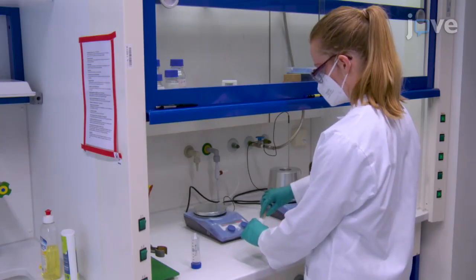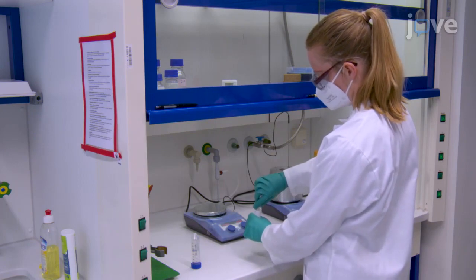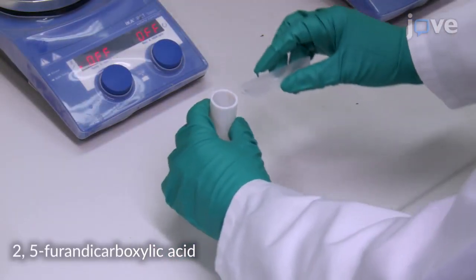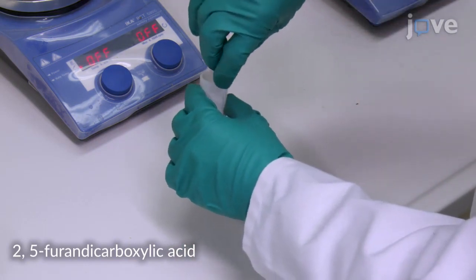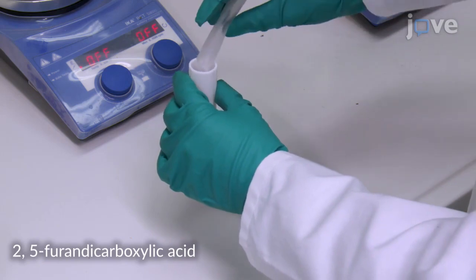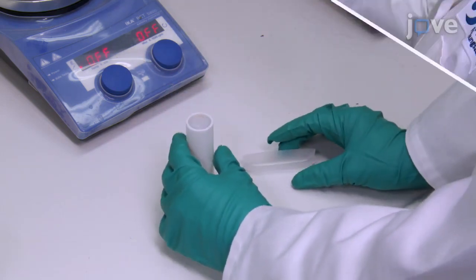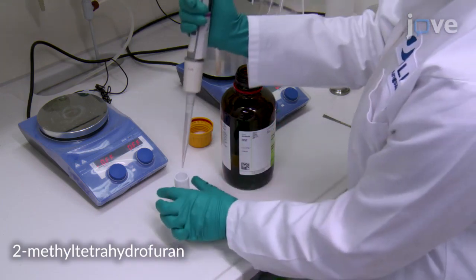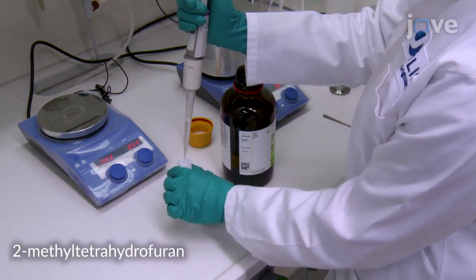Start by suspending 500 mg of beechwood particles and 78 mg of FDCA in 5 ml of AltaPure water at room temperature in a stainless steel high pressure reactor. Then, add 5 ml of 2MTHF and a stirring bar to the suspension.